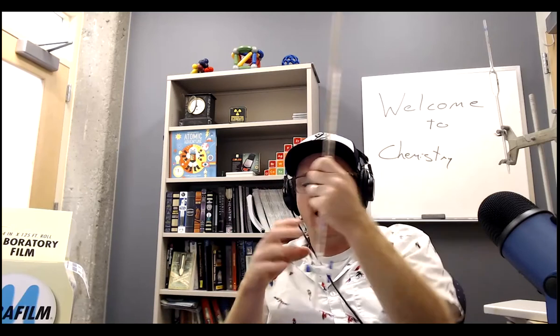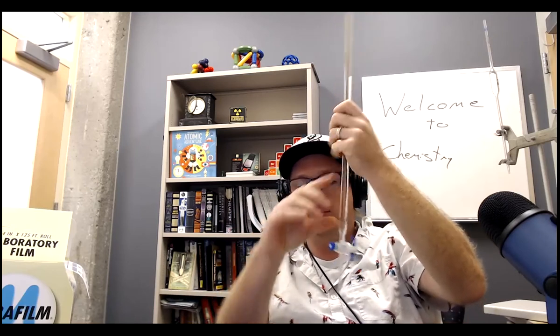This is where the cerium is going to go. Again, it's 0 at the top, 50 at the bottom, because it's not telling you how much it's holding. It's telling you how much you delivered, starting probably from 0. Same thing here, you want to rinse it. I think the cerium comes in a very acidic solution with sulfuric acid. So you've got your funnel here. You pour the cerium with the sulfuric acid in a little bit. Again, you want to rinse it, so you add 5 to 10 mils, no more than 10 mils. 10 mils is a good rinse.